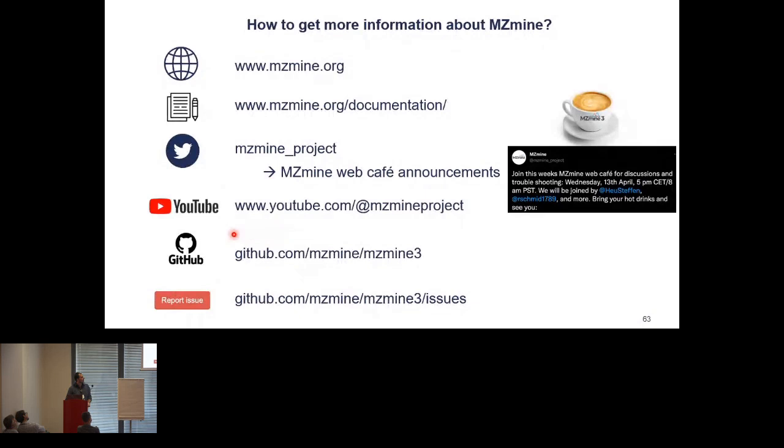We have lots of videos on YouTube where we have tutorials on how to use the software. And if you'd like to join the development, this is the GitHub. You are most welcome to come and join us. And you can also report issues if you find some problem or bug in the software.